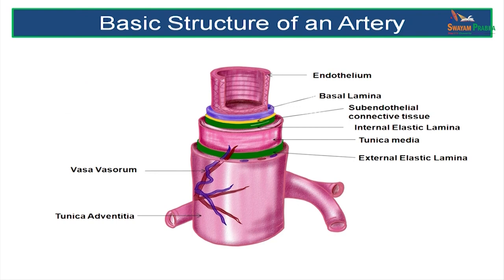Here we can see the basic structure of an artery. The innermost layer is an endothelium made up of a single layer of flattened or squamous cells resting on the basement membrane, also called the basal lamina. Outer to this is the subendothelial connective tissue, and still outer is the internal elastic lamina. These four layers — the endothelium, the basal lamina, the subendothelial connective tissue, and the internal elastic lamina — together form the tunica intima.